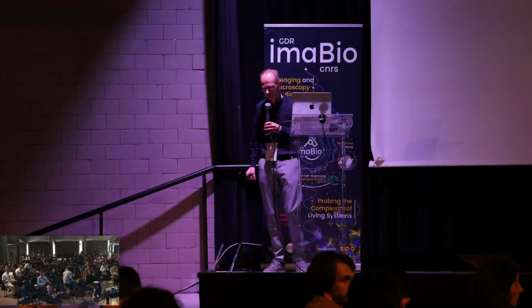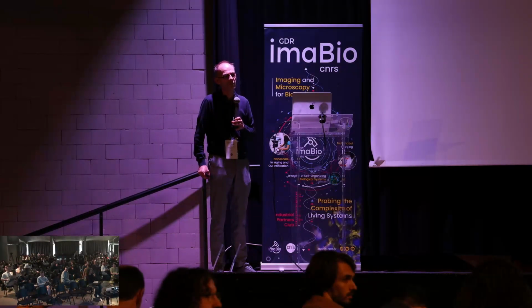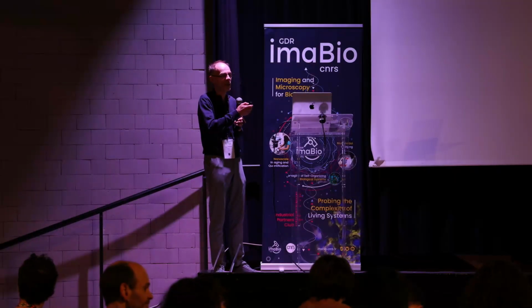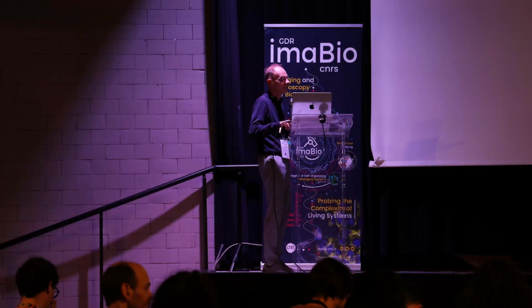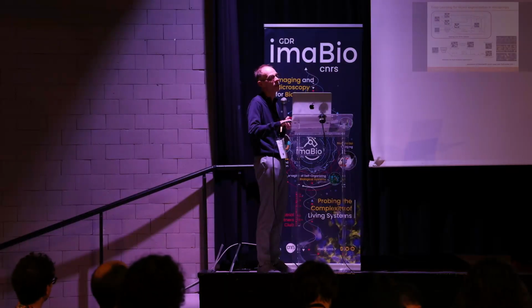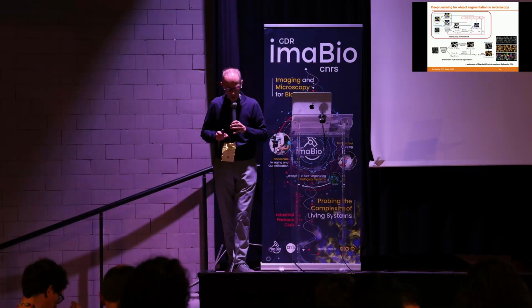Thank you for the great talk. I was wondering, when you estimate the spline instead of maps for the segmentation, you reduce the parameter space. So do you get more robustness in detection by doing so? You mean here, for this? Yes. Okay, I didn't give you details about the methodology here.